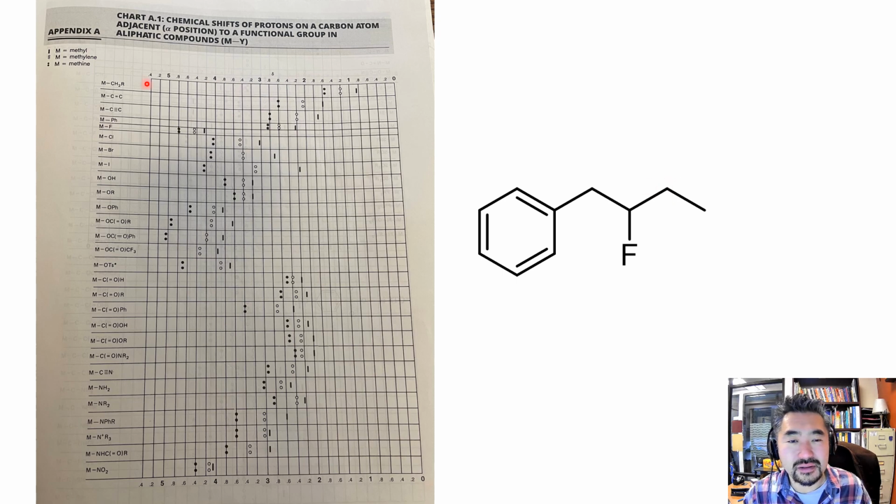But anyway, what about this methylene here, right? Methylene, CH2. So then I'll be looking for this symbol, methylene. And now this is attached to essentially regular alkyl carbons. It's attached to a carbon with fluorine, so keep in mind that in real life this could be shifted a little more downfield than what we're going to see, but that's a methylene that's attached to a regular alkane, right?